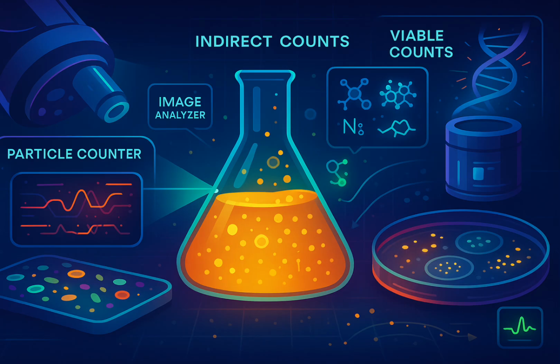Not at all. The complexity comes in right at the start, deciding what you're actually trying to count. Are they alive? Active? And then how do you physically detect something you can't properly see? So that decision, what to count, brings us to the first major split. You're either going for a total count, pretty much every cell, living, dead, active, dormant, the whole lot, or you're aiming for a viable count, which is just the living ones, or capable of living. The ones that are alive, metabolically active, or critically capable of growing under the conditions you give them.